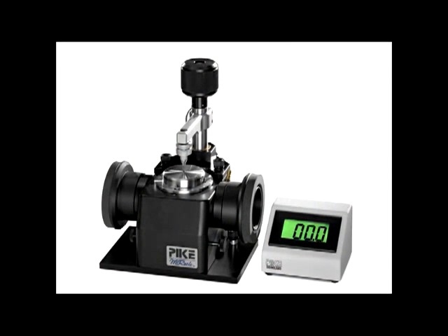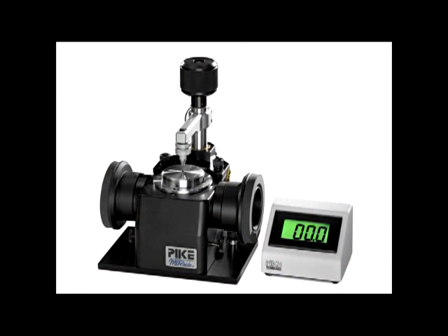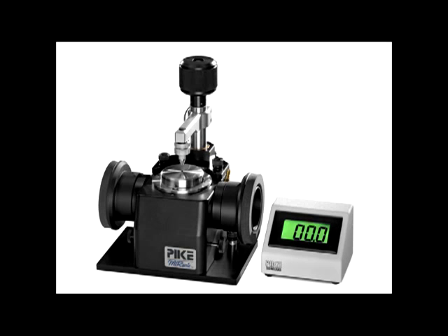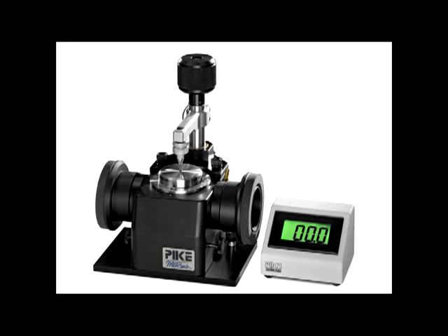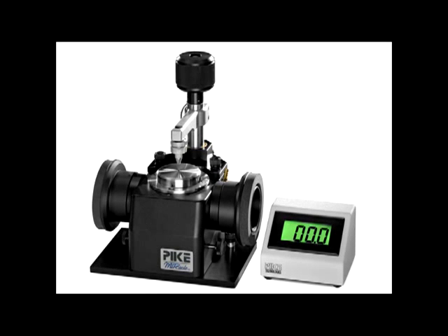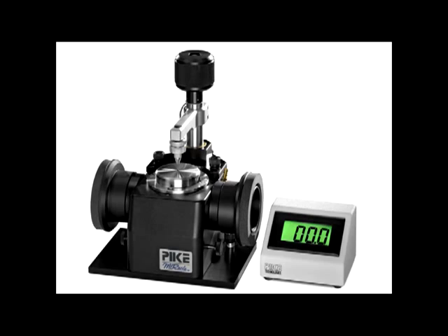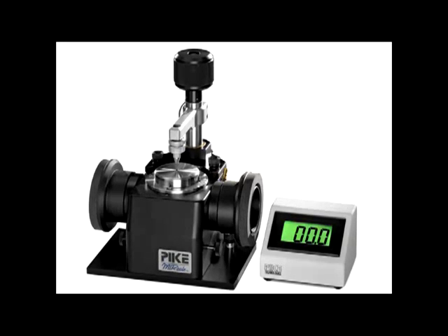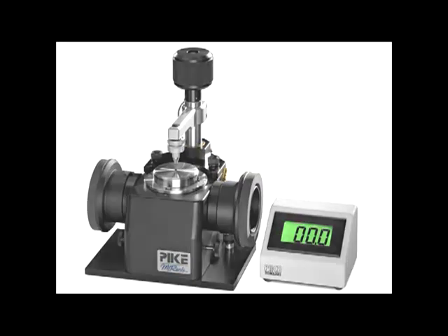Many options are available to make your sampling easier. The digital force clamp with LCD display for controlled and reproducible applied pressure.